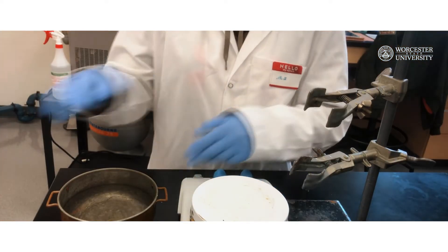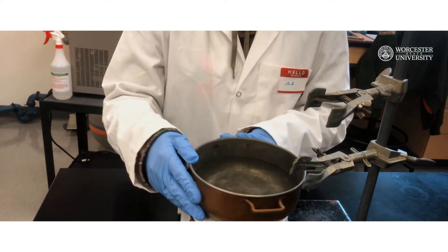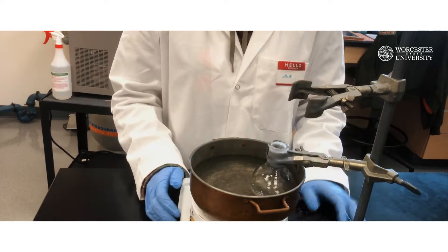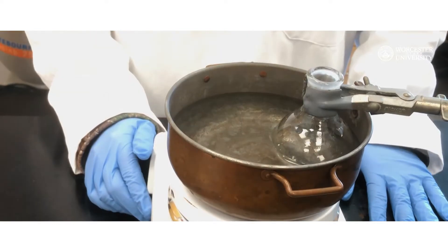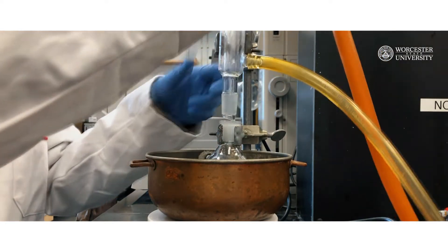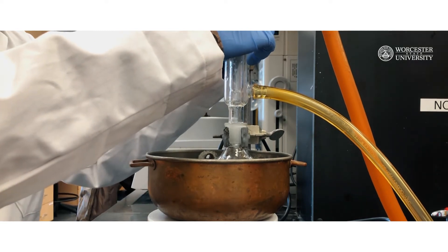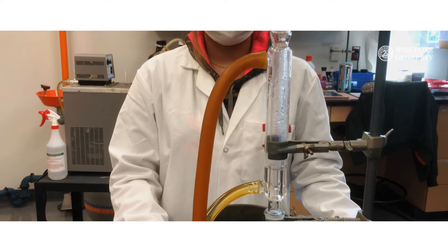Obtain a stand and place a hot plate on top of the stand. Then place a water bath on top of the hot plate. Put the flask inside the water bath and clamp the flask to the stand. Make sure to submerge most of the flask in water. Fit a water-cooled reflux condenser on top of the reaction flask and clamp the condenser to the stand. Attach two water hoses to the condenser such that water will go in from the bottom and out from the top.